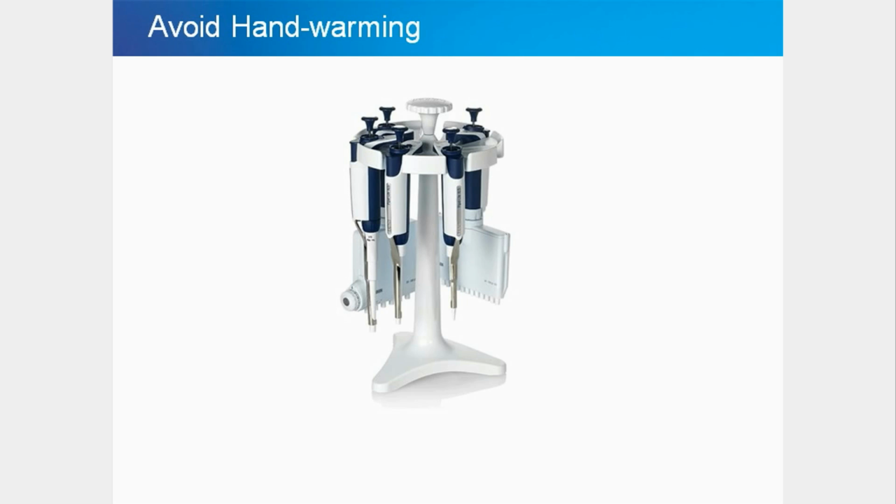Prolonged handling of a pipette can cause a change in the delivered volume, over time, of as much as 0.5%. This is primarily due to the expansion of the air column inside the pipette from hand warming. Pipette shafts should not be handled before and during pipetting activities, since shaft hand warming effects are more pronounced.